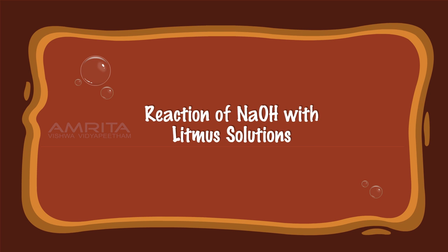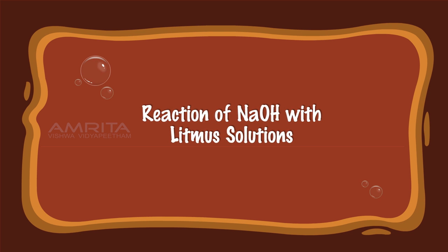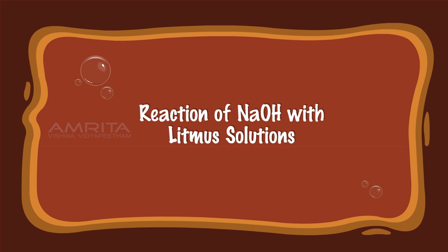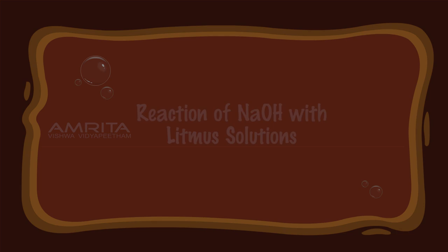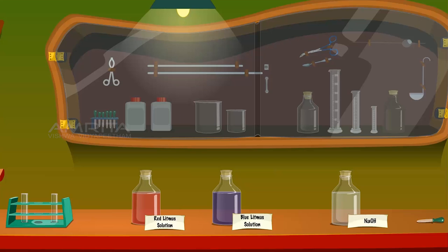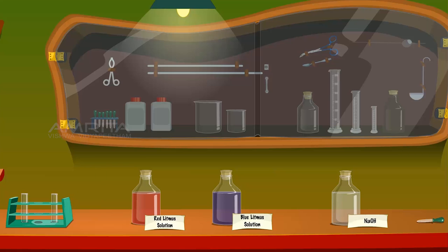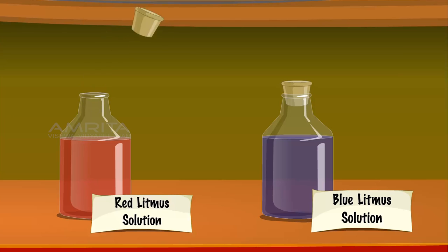Reaction of NaOH with Litmus Solutions. We require two test tubes placed in a test tube rack, red and blue litmus solutions, NaOH solution, and a dropper.